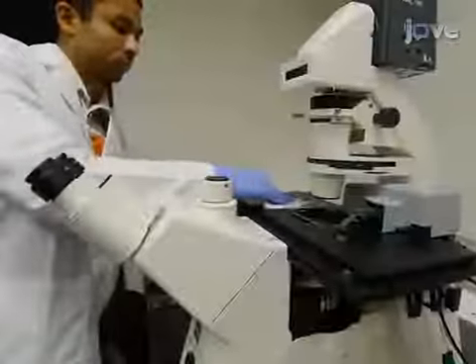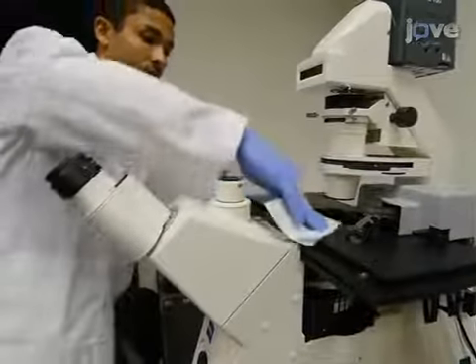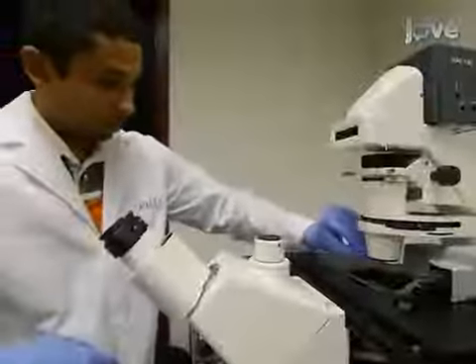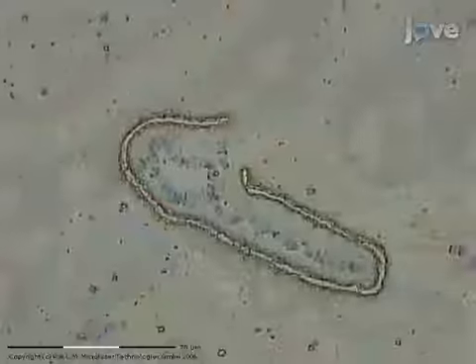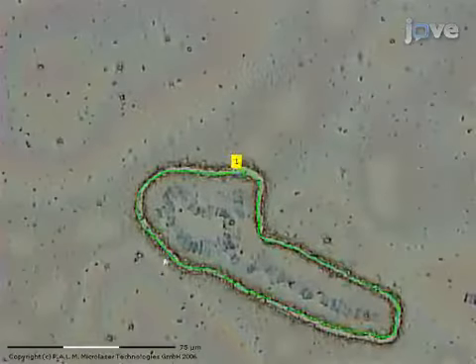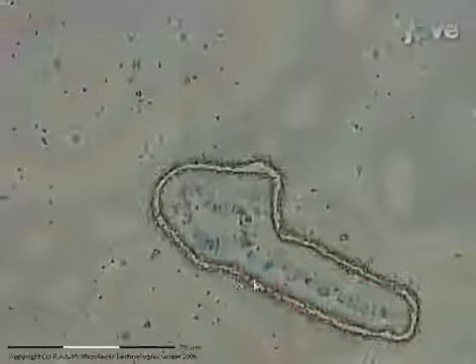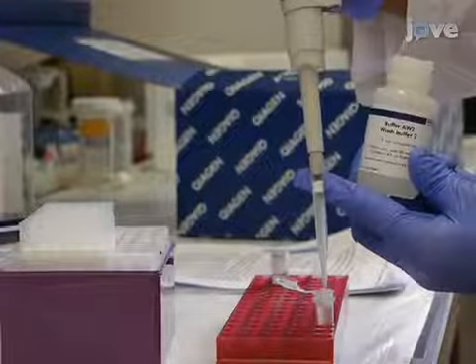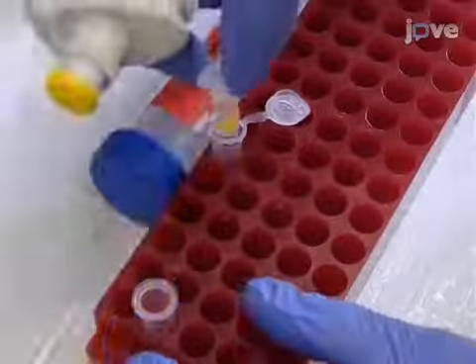Be sure to clean the microdissection scope with ethanol and sterilize gloves and tubes with UV. Then, microdissect the chromosomes following a secondary video provided in the text protocol. Collect the DNA using a QIAGEN kit with a modification to accommodate an inverted tube. Follow this with column purification.